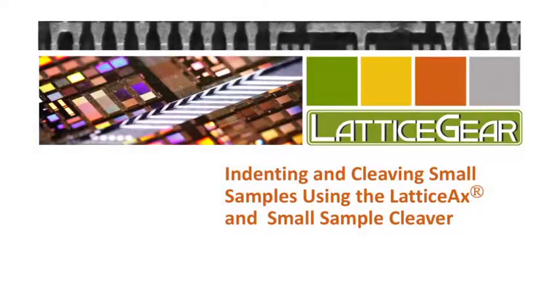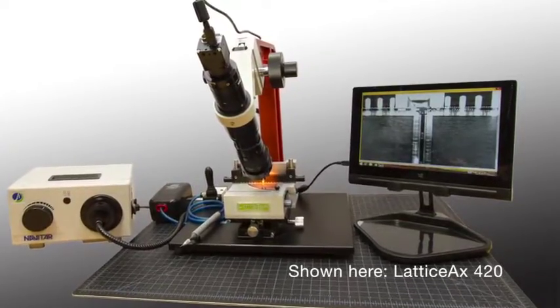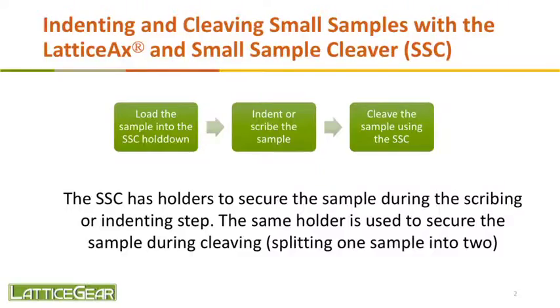This movie will demonstrate how we indent and cleave small samples using a combination of the LatticeAx indent and cleaving system and the small sample cleaver. You will see the sample loaded into the small sample cleaver, held down and positioned in the hold down, and then transferred to the LatticeAx where it will be indented, and then transferred back to the small sample cleaver for the cleaving step.